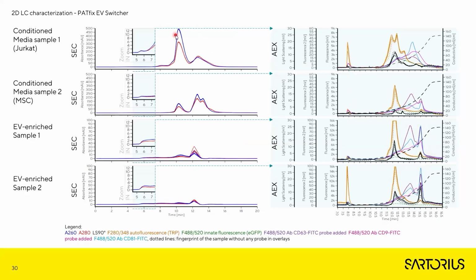So in this slide, you can see a comparison of a few EV samples. Already visually, we can see that the first samples are much less pure.